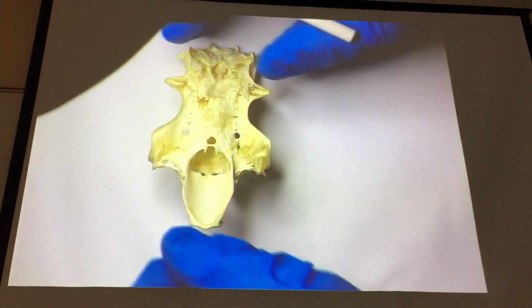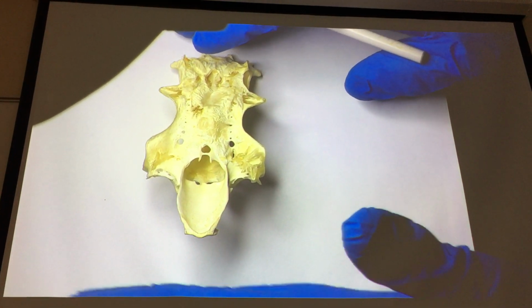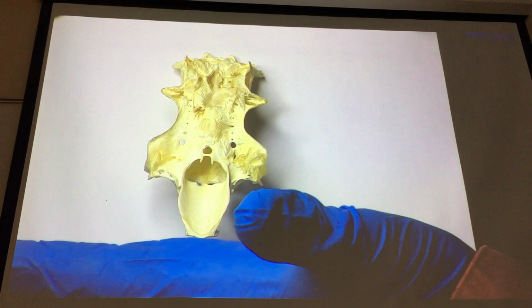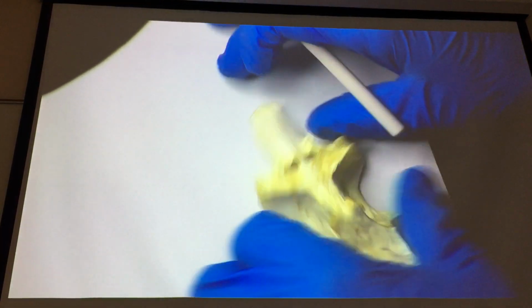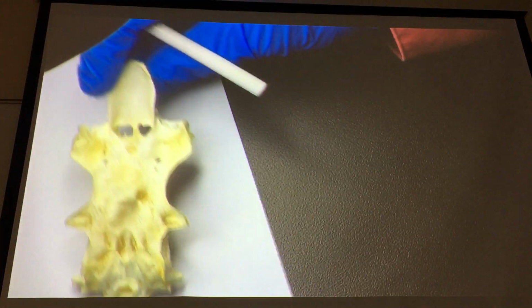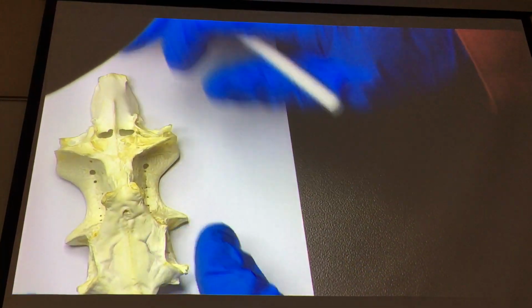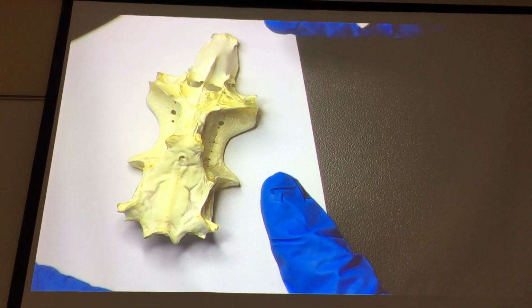So, looking at the dorsal surface, let's focus ourselves first. This is the nose. If this was the poster for the movie Jaws, that. And so there's the nose. Here's the back of the head. This is dorsal. Here's ventral. And of course, this is all cartilage, so this is a chondrocranium.